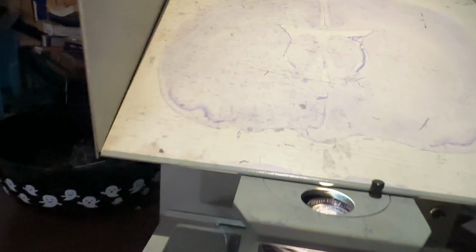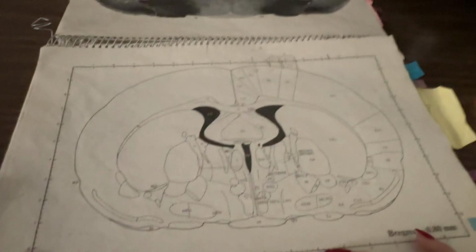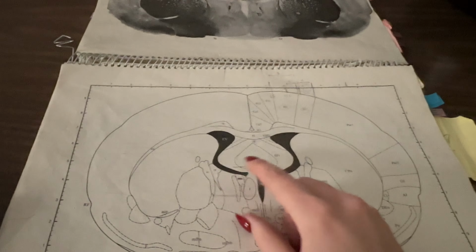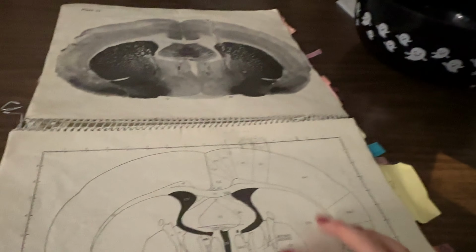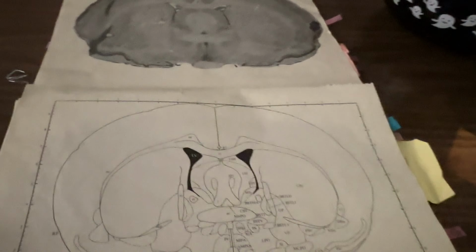Right now I'm looking for the amygdala, which starts right like here. So I'm gonna try to match up what's on this brain to the landmarks of what's on this atlas here. So you can kind of see the ventricles here are looking like this shape, and as you go through the different slices, they'll change shape a little bit. So we're gonna try to match up that, and it's looking pretty close here. So I'd say it's more of like that right now. So this would be a little bit before the amygdala starts.